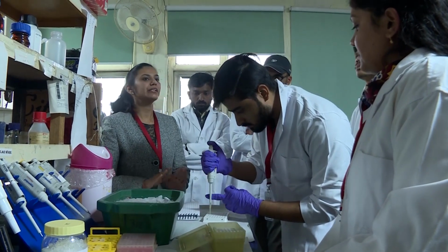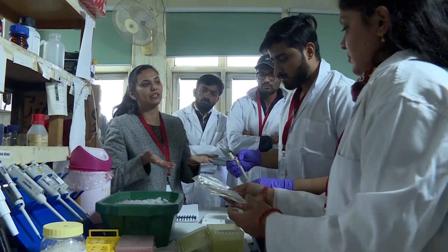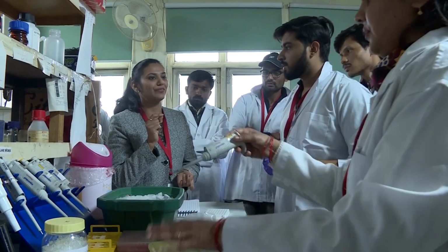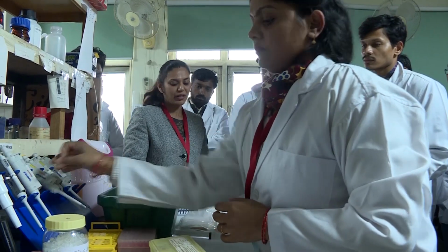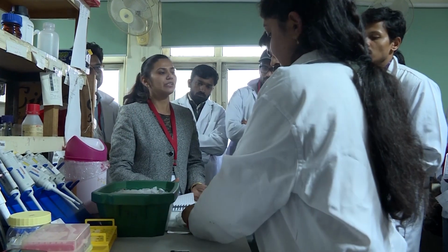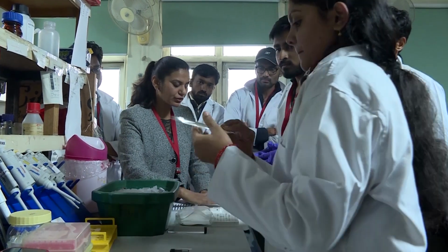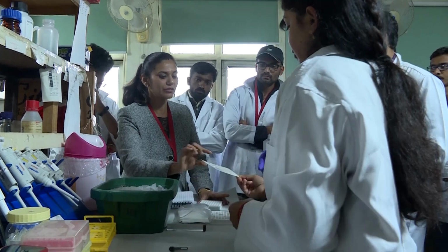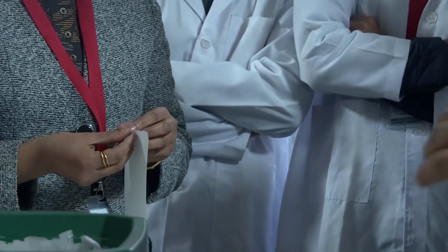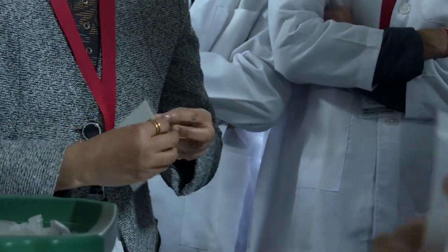Now your reaction is ready. Now the next step is we have to cover it. Otherwise, it may evaporate, because the initial denaturation temperature is 94, 95. Up to that much high temperature, there is possibility that it may evaporate and it may destroy your machine. So it's better. It is a transparent sheet, and we always prefer to cover the complete plate. Okay, so this is the transparent sheet. So we have to cover it like this.